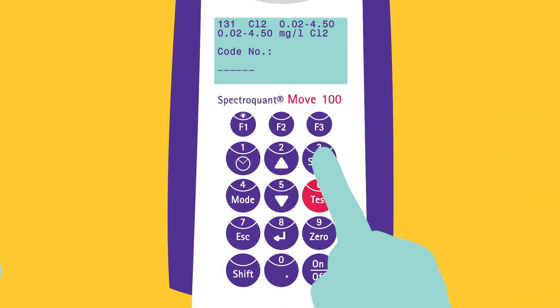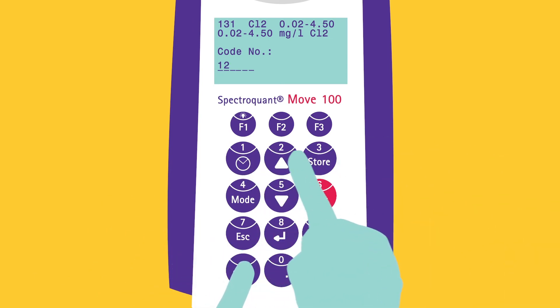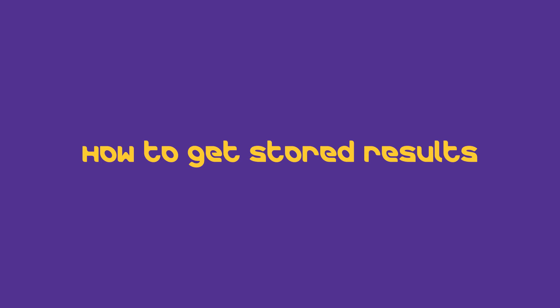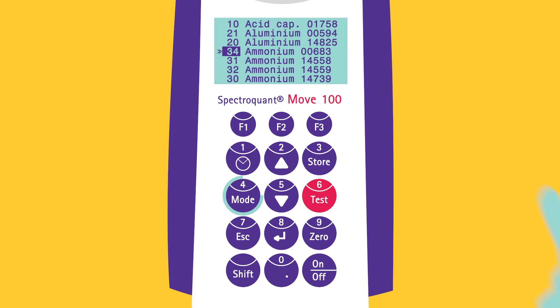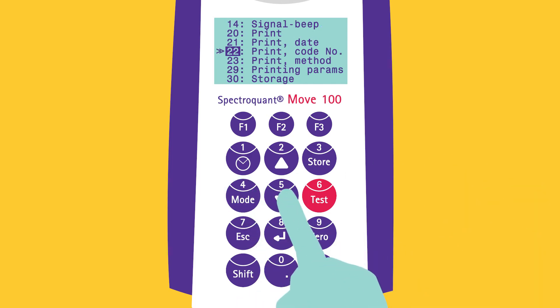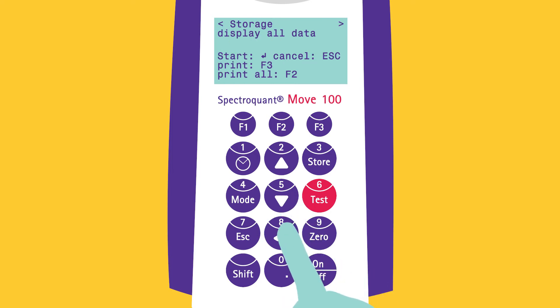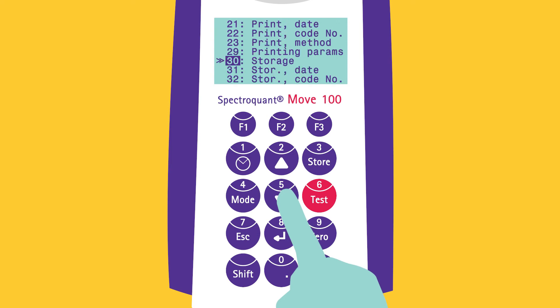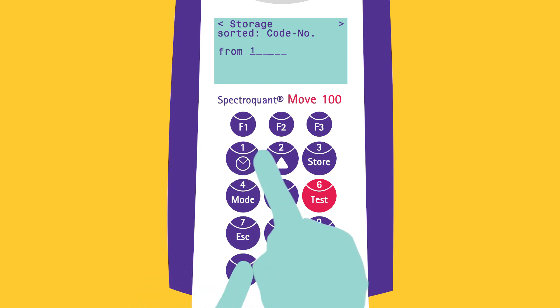The result is saved by pressing the STORE button, and a code can be given in order to retrieve the result more easily. To retrieve results, press MODE and scroll down to STORAGE. Stored results are displayed when START is chosen by pressing the ENTER button, and all results can be scrolled through. Data stored with a code can be easily retrieved by choosing STORAGE CODE NUMBER and entering the code range.